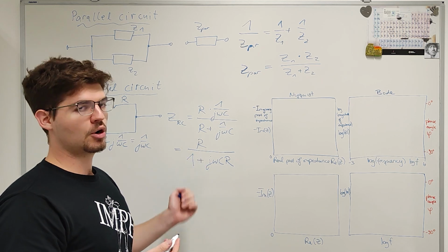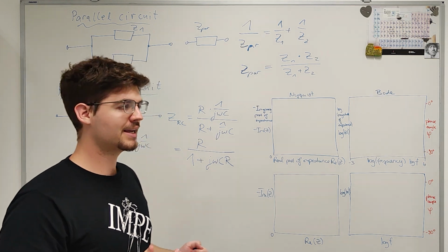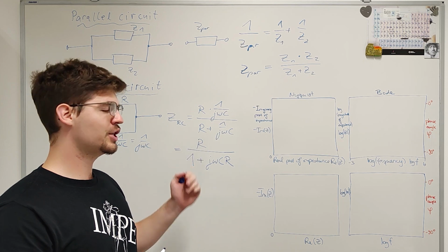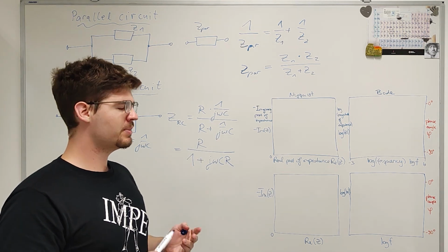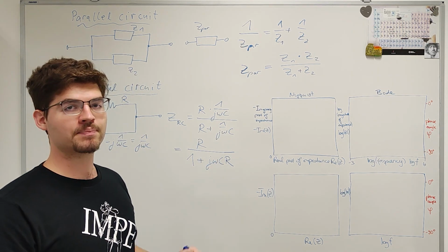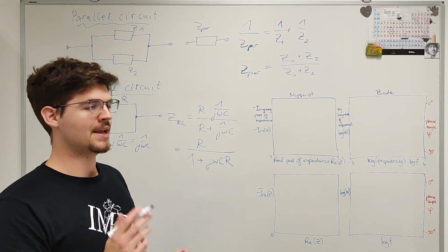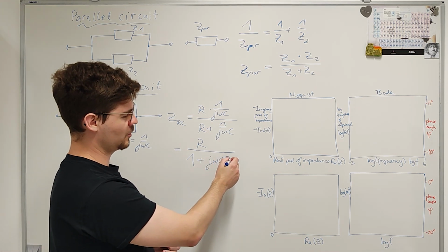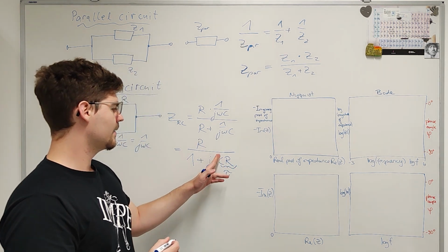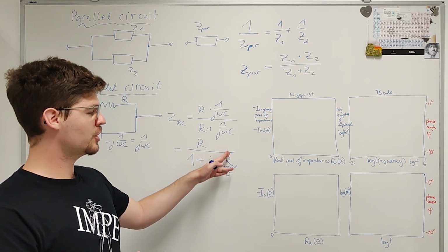Now, since this looks slightly complicated to visualize, and we would like to know what the Nyquist and Bode plots look like, a good technique to approach this is to look at characteristic points, where this calculation gets more simple. And 3 typical points that we would like to look at are where the frequency goes to infinity for very high frequencies, where this approaches 0 for very low frequencies, and where this CR, which we now know as the time constant tau, times omega, which is the speed with which we probe the system, just turns out to be 1.